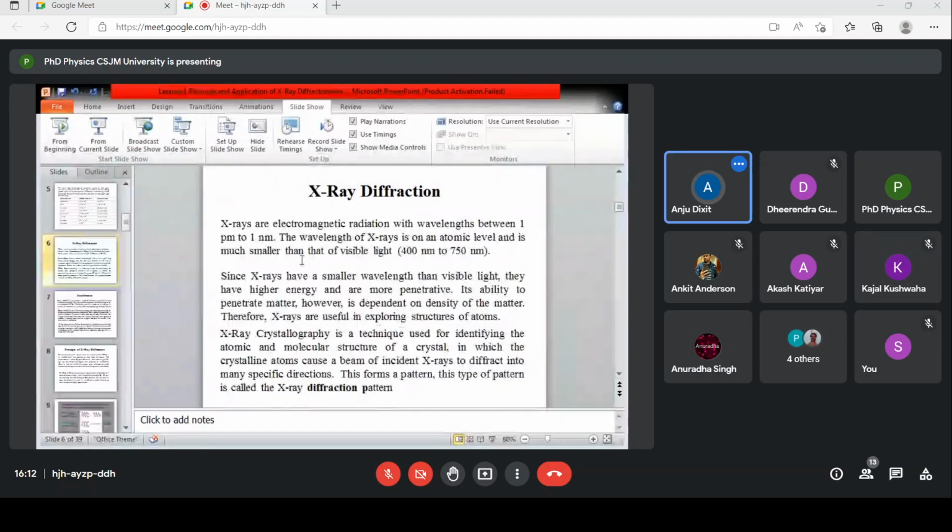So I was talking about this X-ray diffraction and the range of wavelength which it can cover, and we can observe the diffraction pattern of our crystalline material, which has a fixed crystal structure from the 7 crystal systems or 14 Bravais lattices. So we can know the structure of the material with the help of X-ray diffraction. Next, in this X-ray diffraction process, you will see that both interference and diffraction patterns are formed. So we are going to have constructive interference, and from that this diffraction pattern forms, from which we can have the information about our crystal structure.